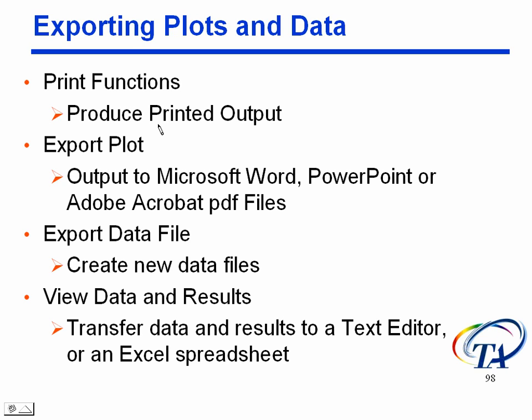Okay. Now you can also export plots in addition to just the printer. You can export to Microsoft Word, PowerPoint. You can actually create Adobe Acrobat PDF files now with this program.